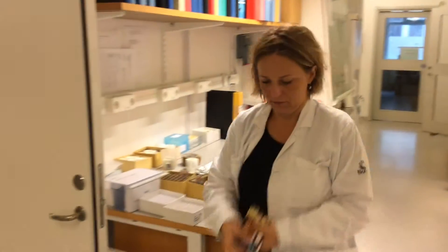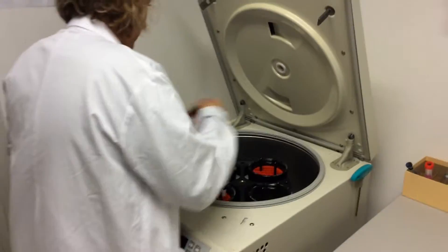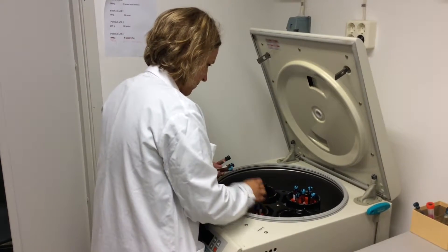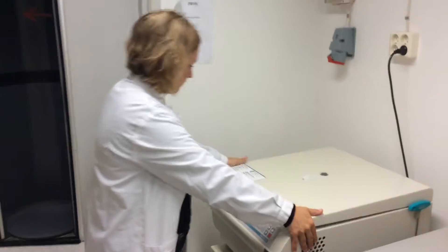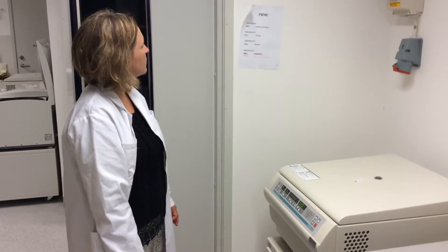She mixes ten times. This is the first spin of the PBMC process and the samples will be in the centrifuge for 20 minutes.